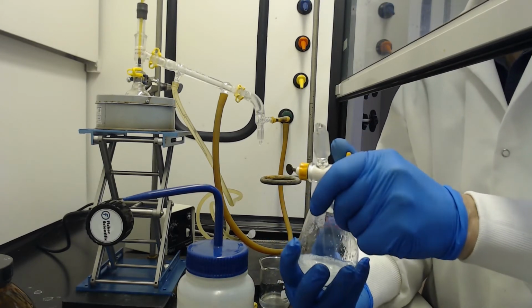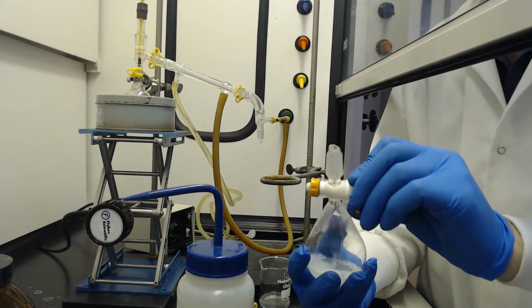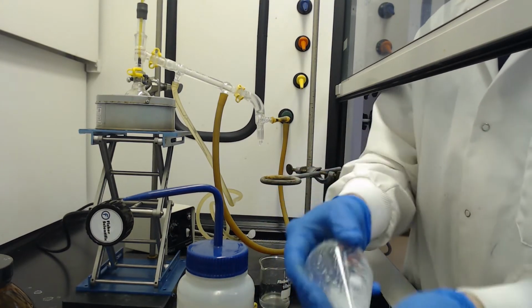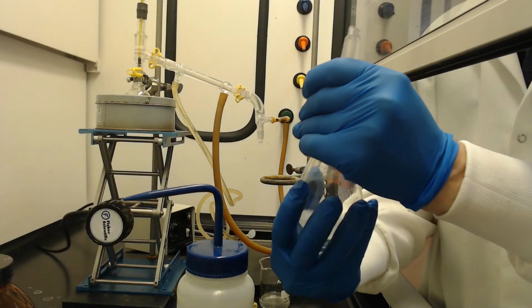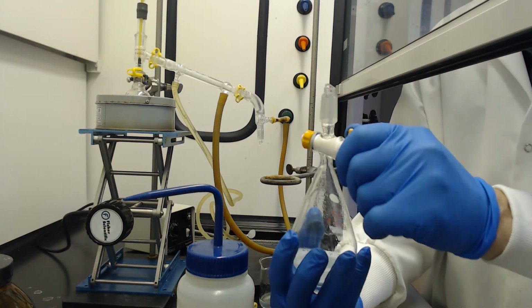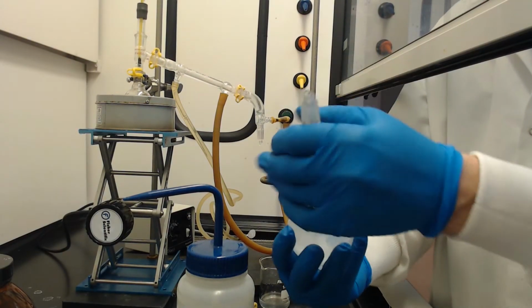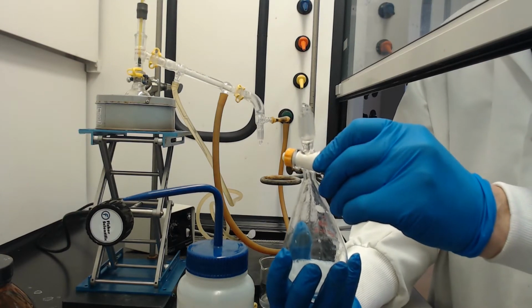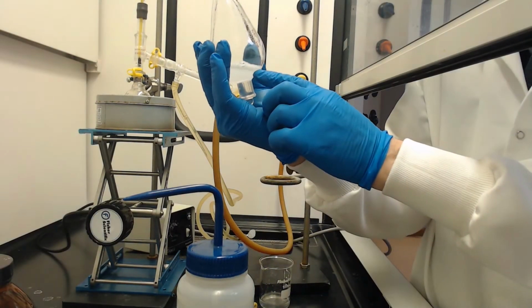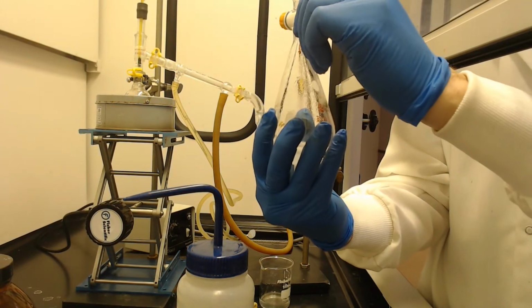Like that. And okay, we're not seeing a vigorous gas generation, so that's good. As I do this carefully, I'm keeping that bottom here, keeping that stopcock in place. Okay, so we're not getting a lot of gas coming off of here. You wouldn't expect a lot of acid to be distilling over, but we're getting a little bit. You can see how there's a lot of bubbles in this top phase, which is CO2.